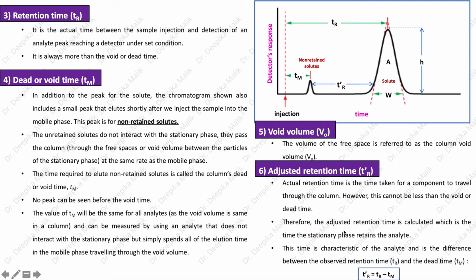Next is the retention time. It is the actual time between the sample injection and detection of an analyte peak reaching the detector under set conditions, as indicated in the graph. It is always more than the void time. Now, what is dead or void time?